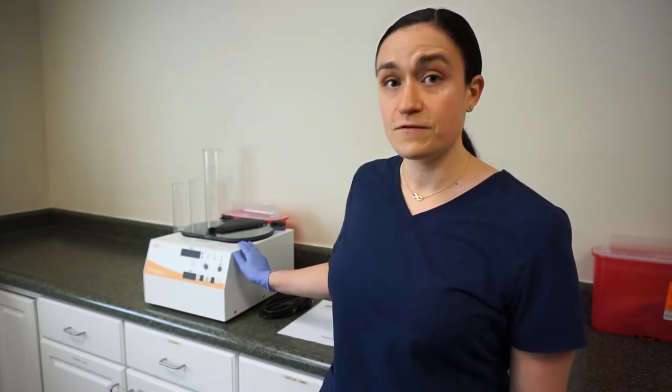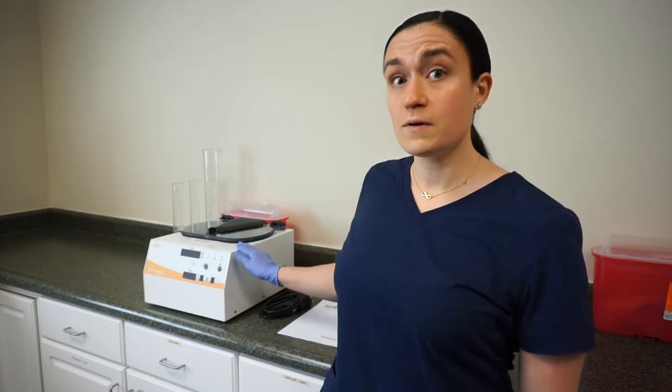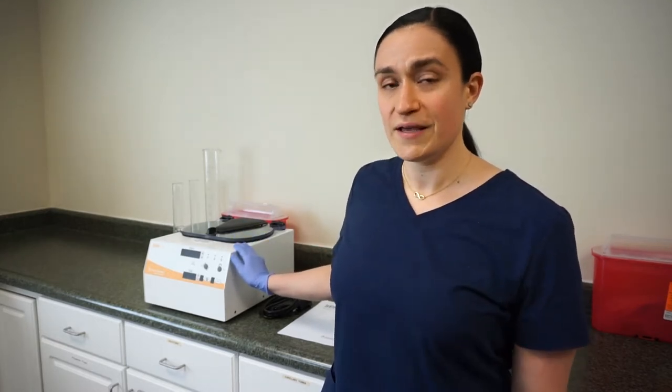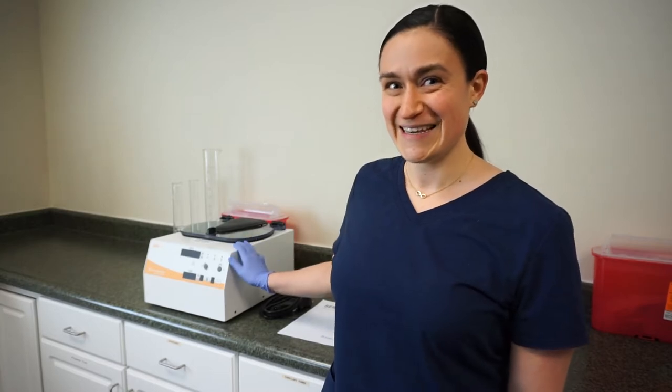All right, now that we're all unpacked, let's look at what each of these does. First, we have the centrifuge. Your SARA-12 arrives with the rotor already inside of it, and before we can open it up, we're going to need to plug it in so we'll actually look at that rotor in a minute. But just trust me, it's in there.